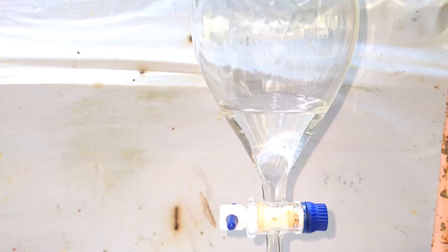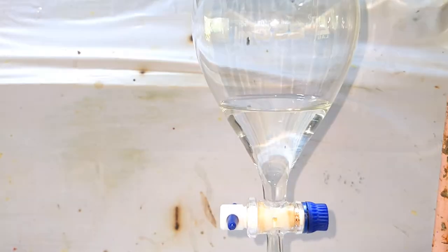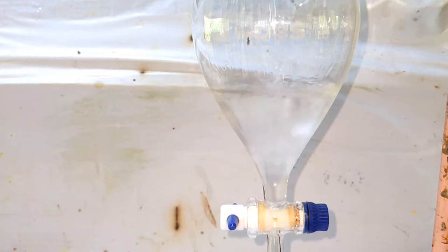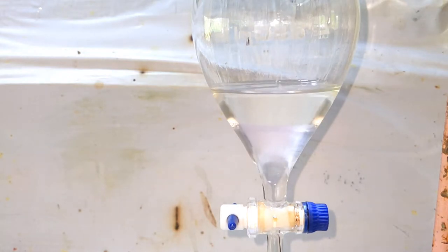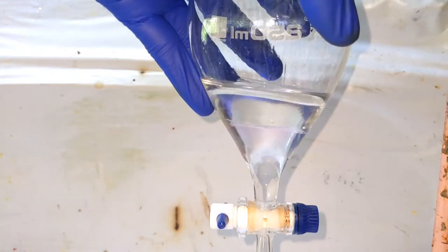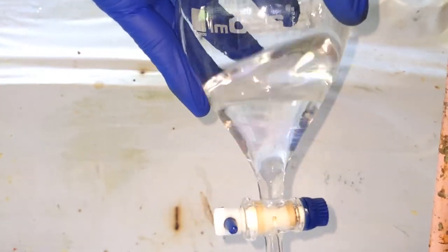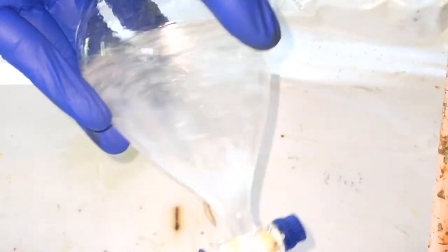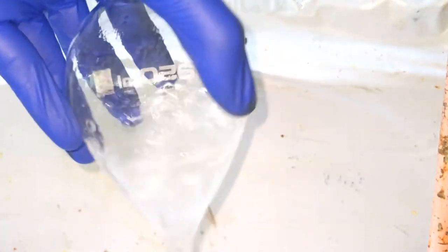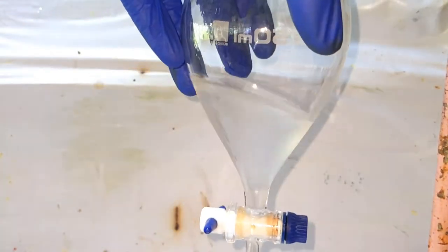Then the organic layer was washed with some 25 to 50 milliliters of distilled water. This would ensure some of the acid and even some impurities, if any present, which have more affinity towards water would be removed with the water layer.